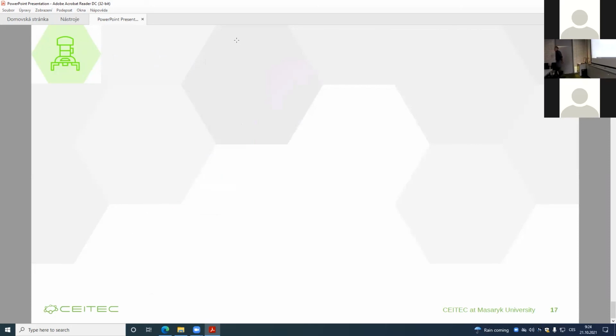I have a question about the breakdown application. The expected throughput. So I mean, yeah, we don't do that blindly. We had a chance for a couple of demos in the factory here in Brno. Both myself and Jana were able to lift out and polish 4 to 5 lamellas a day in a kind of 8-hour day shift.